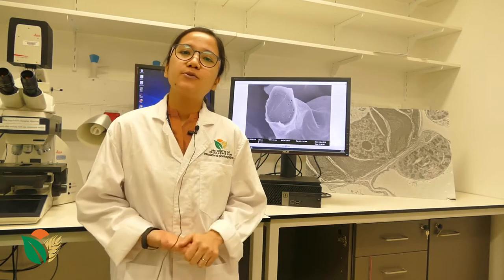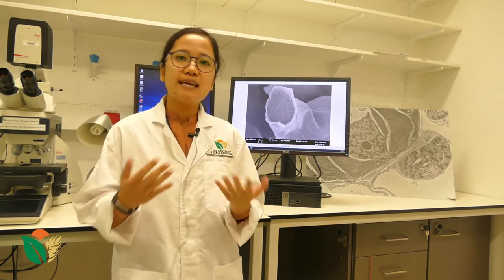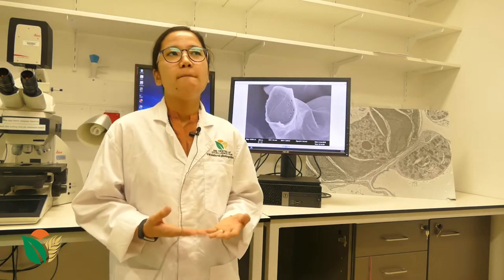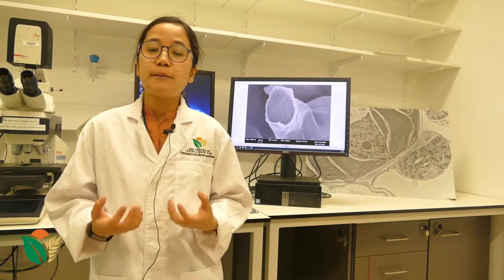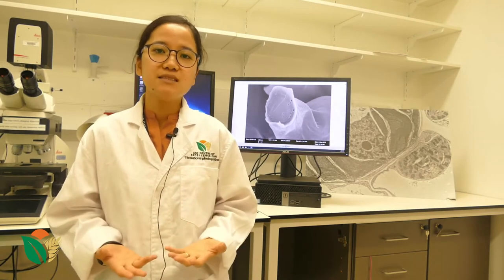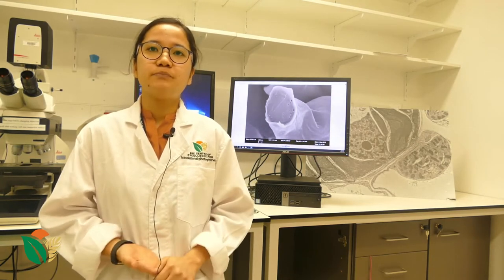With a light microscope, we're used to specimen preparations such as slicing thin sections, staining, and then looking at it under the microscope. But for SEM, because of its special requirements such as the use of an electron beam, we also need special sample preparation. This special sample preparation includes coating the specimen with a thin metal such as platinum or gold, which will avoid charging during the imaging process.